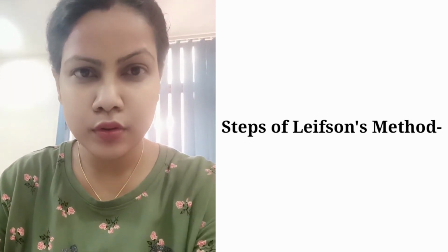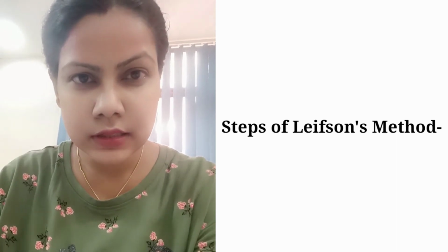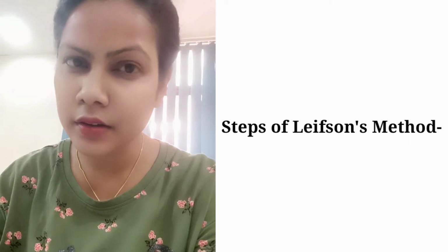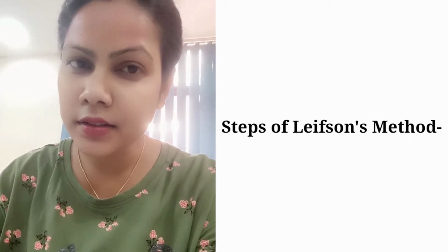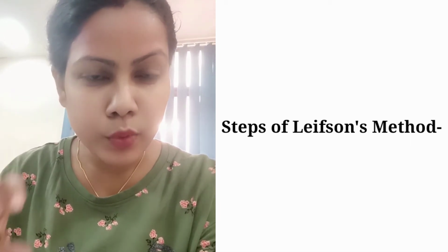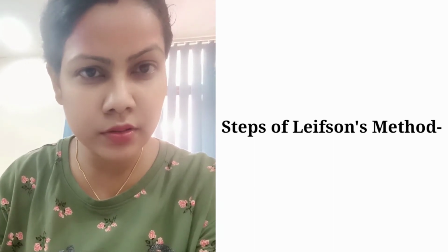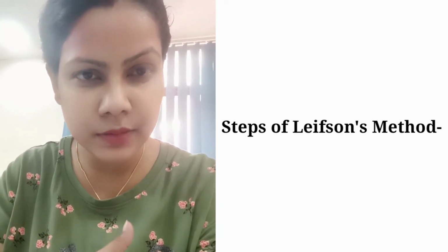Firstly, we will go through the gross steps of Leifson staining, and then we will discuss the theoretical and conceptual points related to every step.